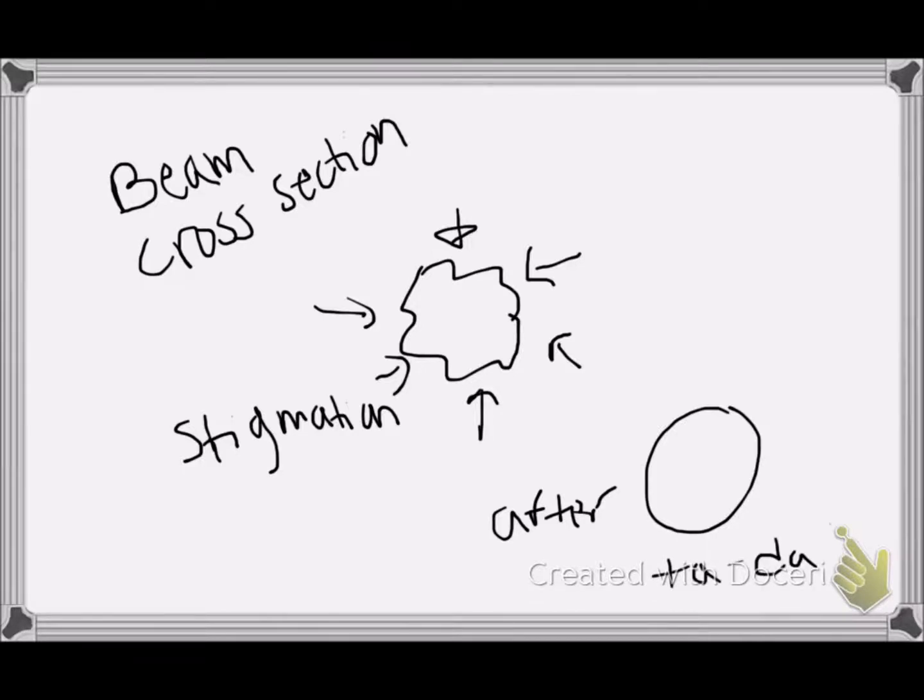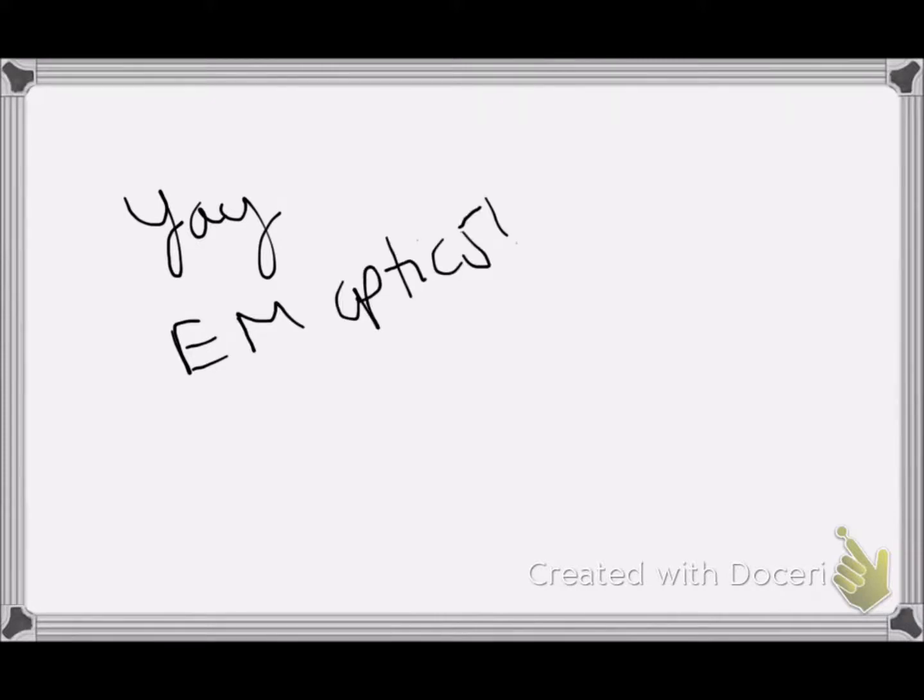Electromagnetic lenses are powerful tools and are the meat of what produces your images in a TEM. Many improvements have been made to them over the years to counteract any imperfections.